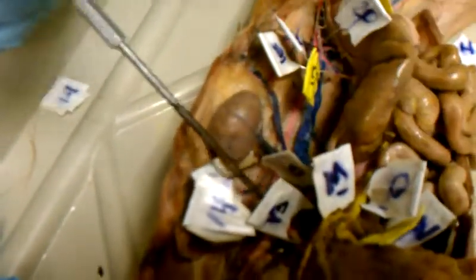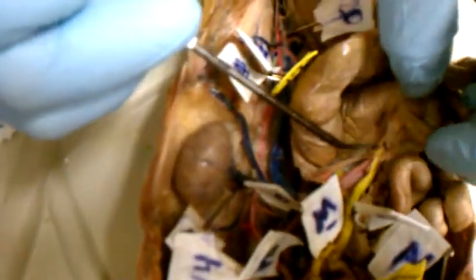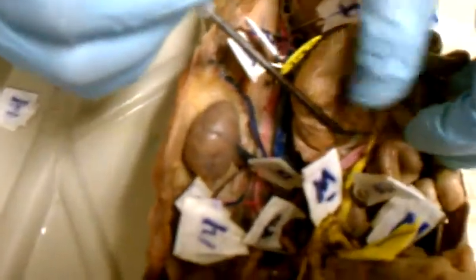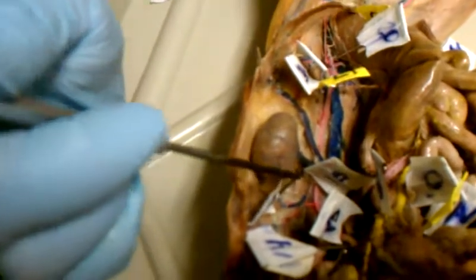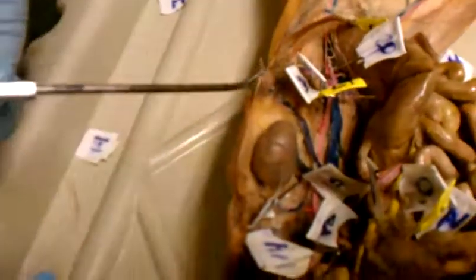Now, go back to the descending aorta. So we've got the celiac trunk, the first split off. The second split off is the superior mesenteric artery. And you can see it comes alongside the superior mesenteric vein right here in the guts, at the top, small intestines, okay? The next branch off, we don't need to know the gonadal, do we? Okay. So the next branch off is the renal. There's the renal artery and the renal vein, and of course they're going to the kidneys.